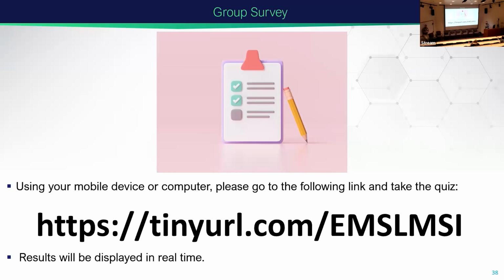In our case, especially in MALDI imaging, we mount it off. And I don't know why in FTICR we need those conductive surfaces, though, but okay, let's not go into detail there. Yeah, you need to have a conductive surface as well. So that's also something that you need to think about. That's why we put those conductive tapes there to mount the sample. All righty, thanks. Thank you.